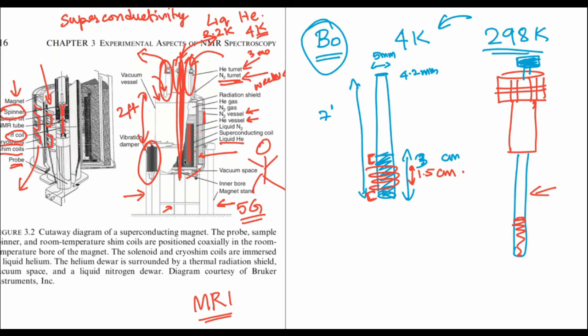First of all, you drop a glass in 2 feet. What's going to happen? Glass is going to shatter on the probe. That's not safe, isn't it? Yes, sir. On top of it, after that, how are you going to get it out? So the way you do it is with the help of the airlift.